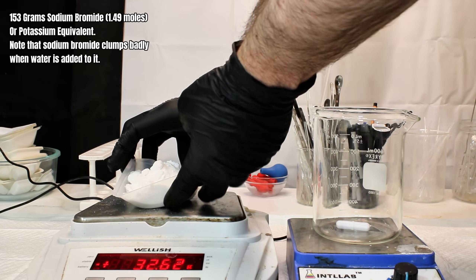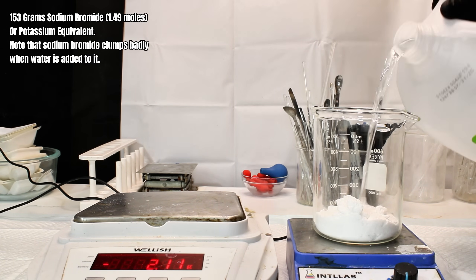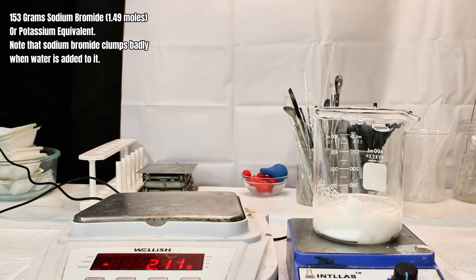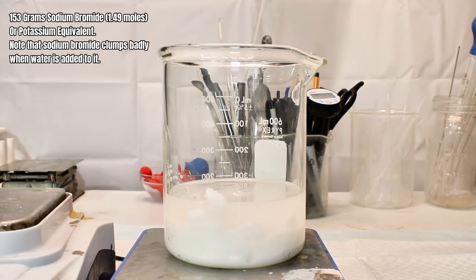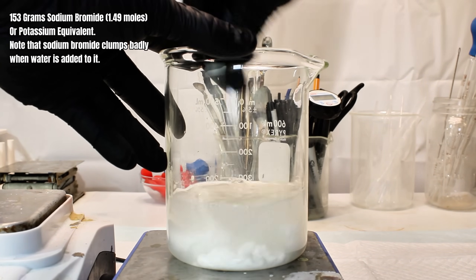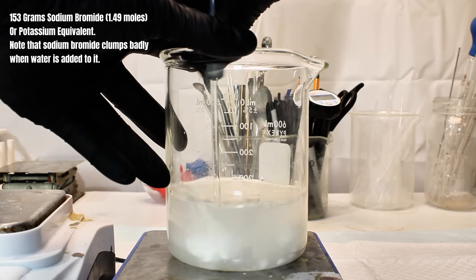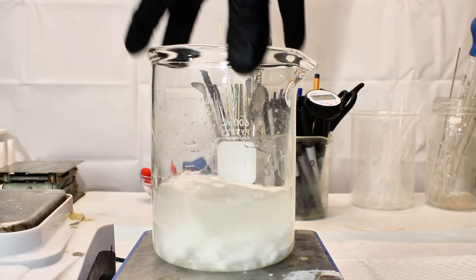To get started, I first weigh out 153 grams, or nearly 1.5 moles, of sodium bromide. I would strongly recommend adding sodium bromide to water instead of how I did it here, if you want to save yourself some headache. Once the sodium bromide does completely dissolve, I transfer it to a three-neck round-bottom boiling flask, to which I then connect an addition funnel.